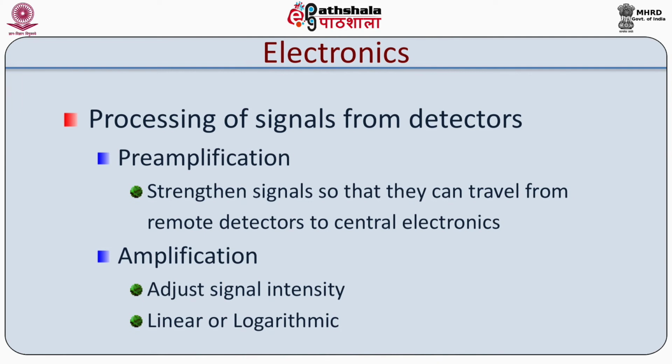The electrical current travels to the amplifier and is converted to a voltage pulse, which is then converted to a digital number. The highest point of the pulse occurs when the particle is in the center of the beam and the maximum amount of scatter or fluorescence is achieved. As the particle leaves the beam, the pulse comes back down to the baseline.